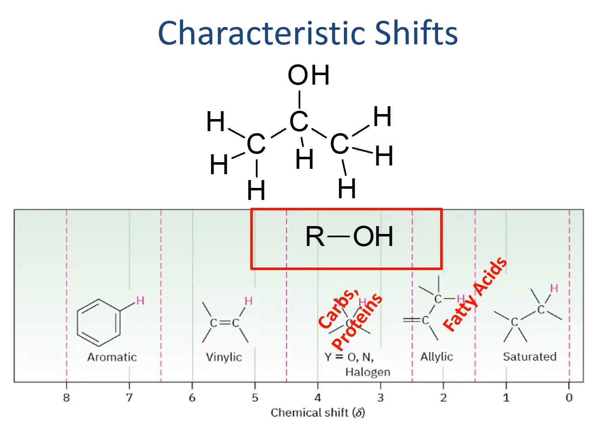So for our molecules shown, we can figure out how many different types of peaks there are, which we've done before. Why don't you pause and try to identify how many distinct peaks we would see? So how many different peaks would you expect to see for the molecule of isopropanol, or 2-propanol, that's shown at the top here?